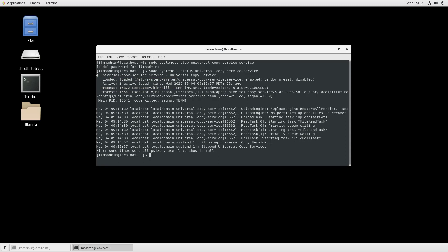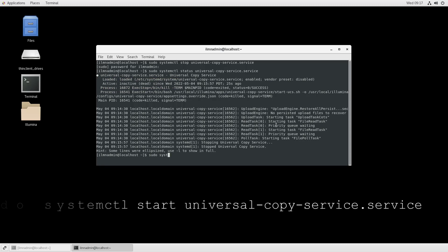To start Universal Copy Service, type the command sudo systemctl start universal-copy-service.service and press Enter.